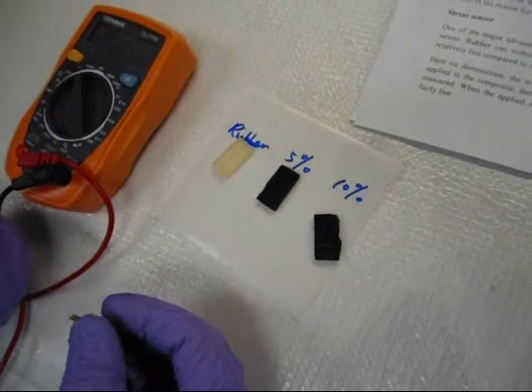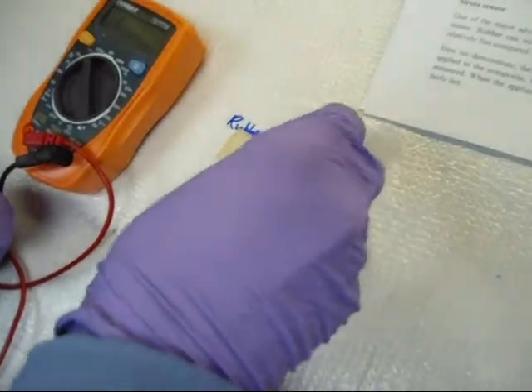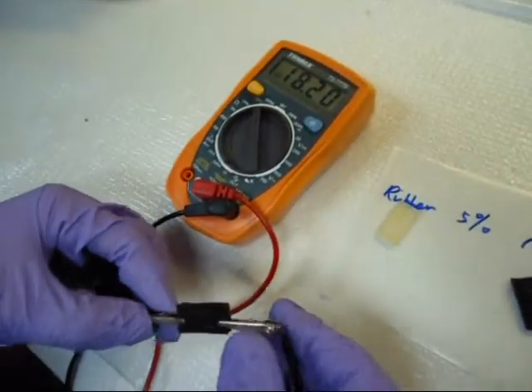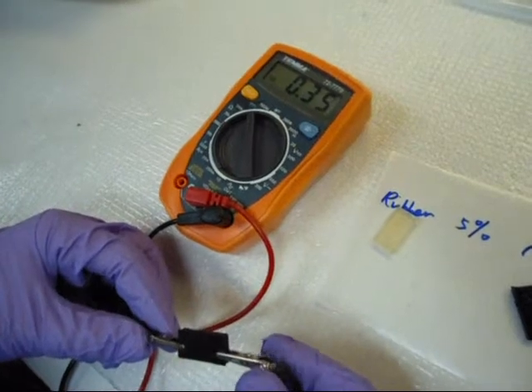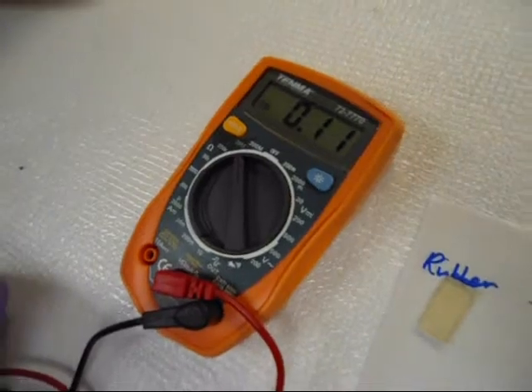Now, we are seeing by adding 5 weight percent of graphite into the rubber, its resistance will decrease. Now, its resistance can be measured with our equipment. Its resistance is 0.1 megaohms.